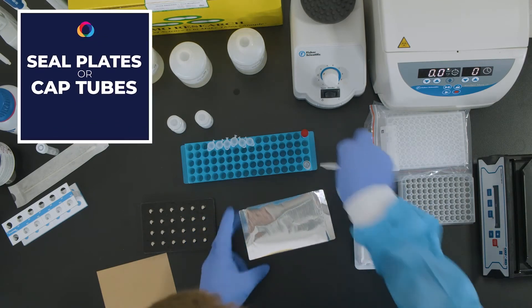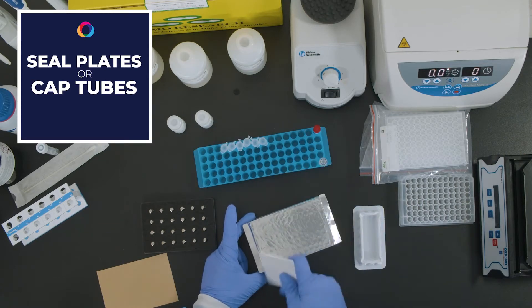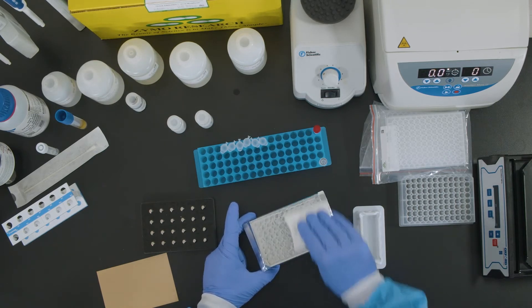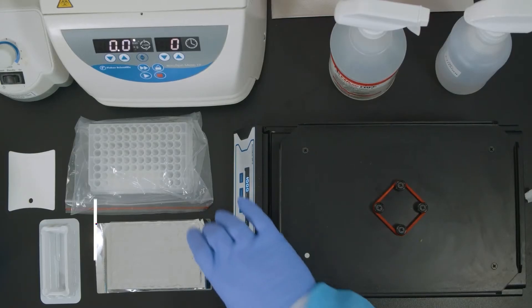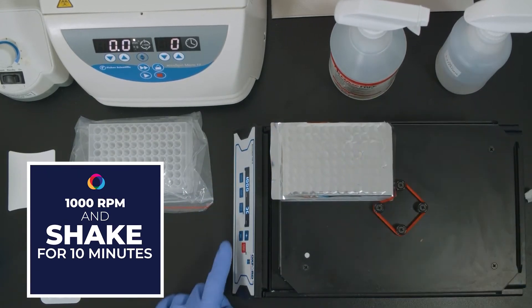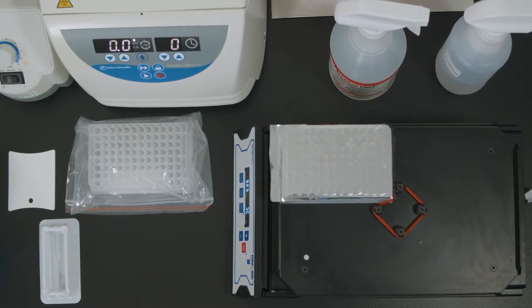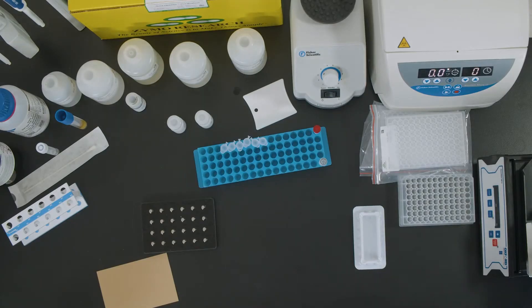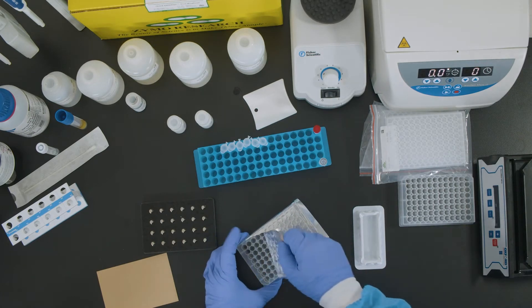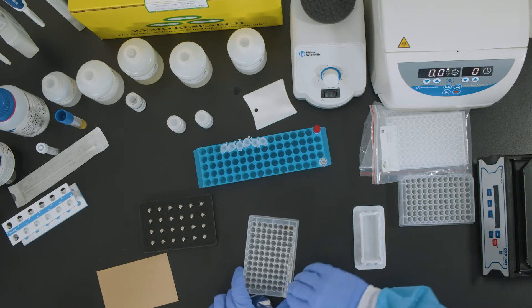Seal plates or cap tubes. After mixing for 10 minutes, carefully remove the seal from plates to avoid any splashover.